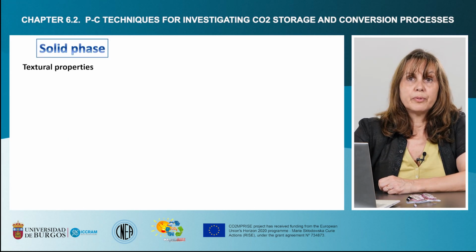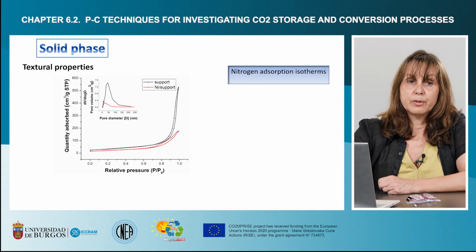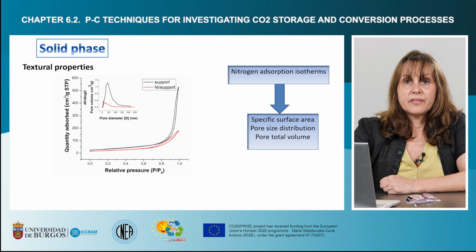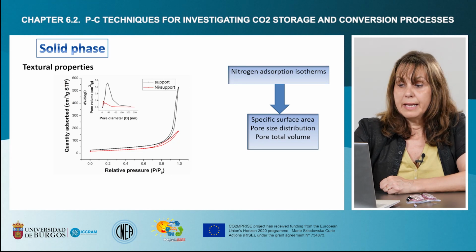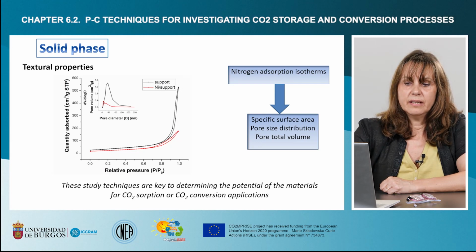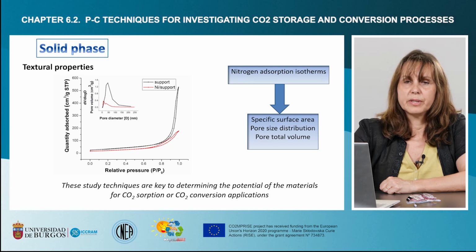Finally, textural properties are also important. These properties are obtained by nitrogen adsorption isotherm, in particular specific surface area, pore size distribution, and total pore volume of the material. Finally, these techniques are key to determining the potential of the material for carbon dioxide sorption and carbon dioxide conversion applications.